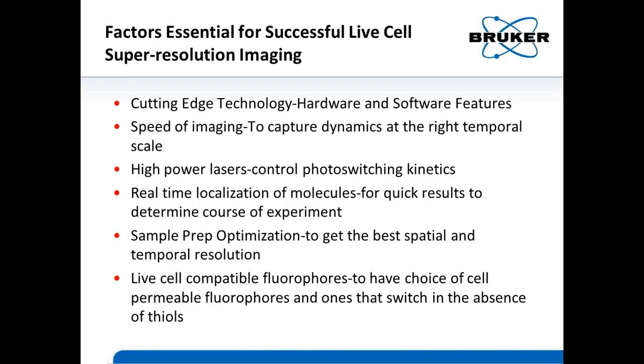And in terms of the software, you need to have very fast, pretty much real-time localization of molecules. As you're acquiring, you need to be able to localize the molecules. And this is not a trivial matter, especially when you're looking at something in 3D. So you need to be able to localize these molecules in 3D in pretty much real time so that you can decide what the next course of action will be.